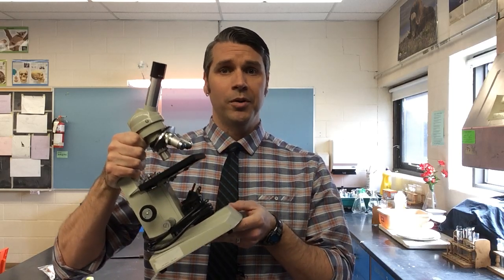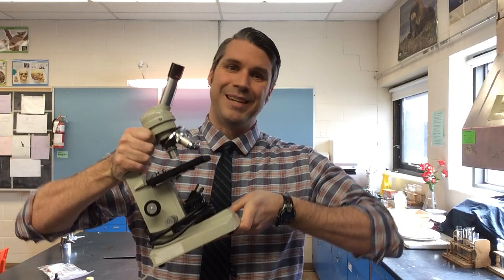Hello and welcome to making a cheek cell slide. This is a microscope. Please remember when carrying one to your workstation to always use two hands, just like me.